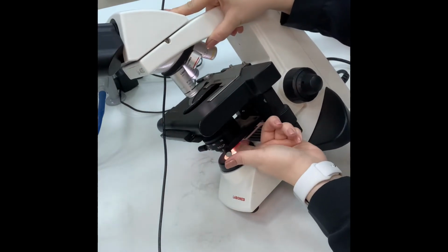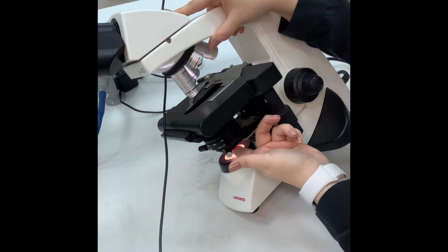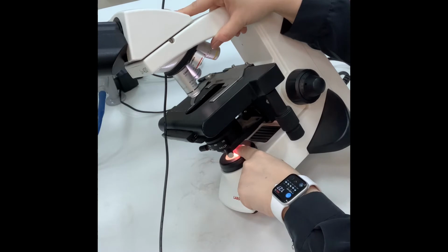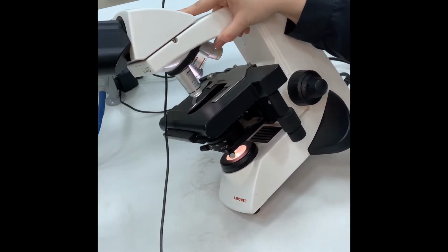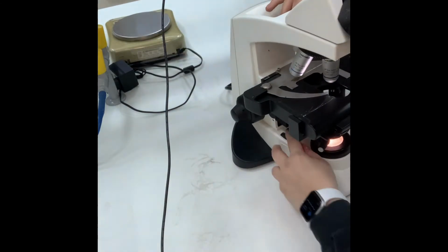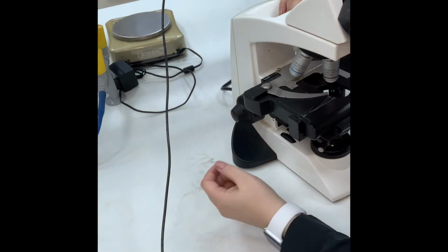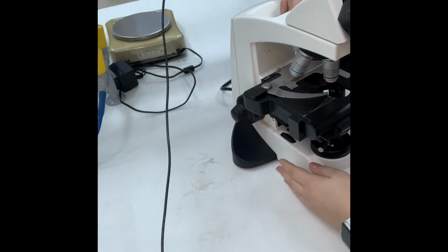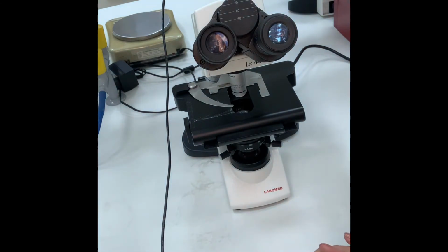Now, this lens over here, which I cannot remove, is called the iris diaphragm. This is the light source. This is the base of the microscope. And I have two knobs. Those knobs are for the light, basically. This is the light intensity. And in the back, I have the light switch. Now, sometimes you find both of them in the back, or both of them on the base. This depends on the manufacturer itself.